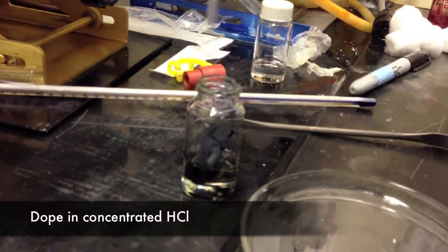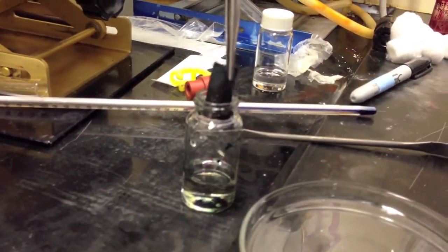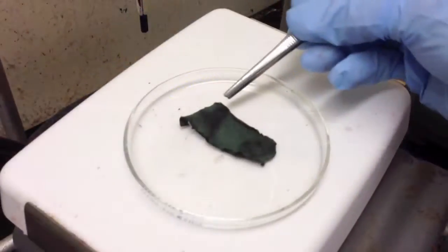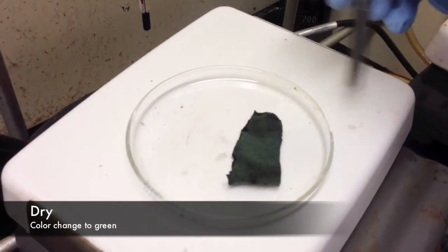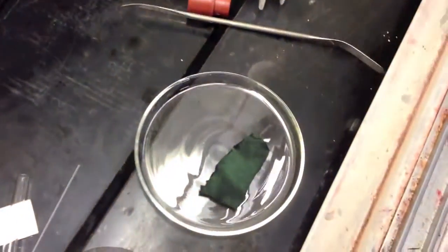We then re-doped our polymer by submersion in hydrochloric acid. Exposure to hydrochloric vapor was also used, but for best results it seemed that we needed to again completely penetrate the fibers of the fabric. We then dried this by gentle heating and saw a color change to green, indicating that our polyaniline was re-doped.